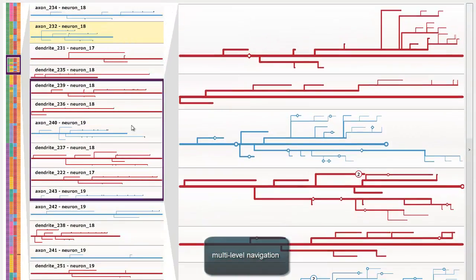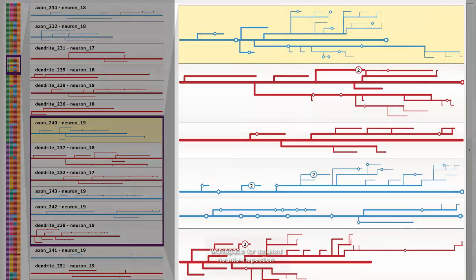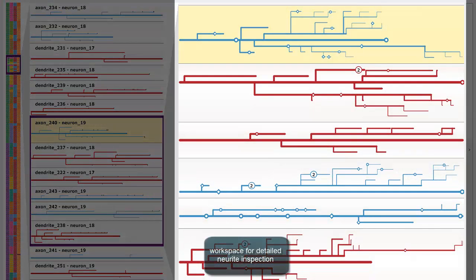The right view is the so-called workspace. It allows us to inspect individual neurites and look at their branching patterns, synapses, and synaptic chains in more detail.